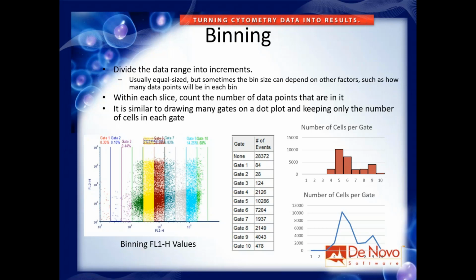On a common, maybe lower-end machine these days, there are approximately 262,000 channels that it'll get assigned to. There are more on some other instruments, but it does get assigned to a particular bin. What's important is that the plots that you see are actually binned at a much lower resolution, even than the 262,000 channels. And a bin is really easy.